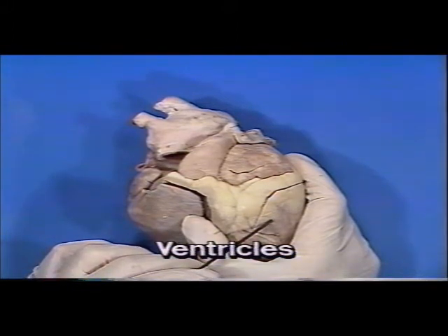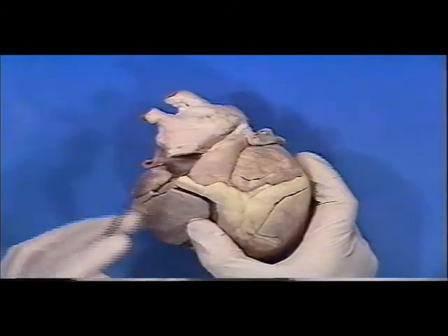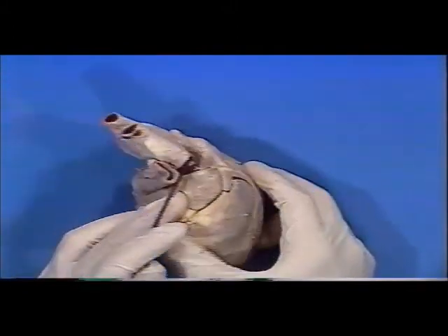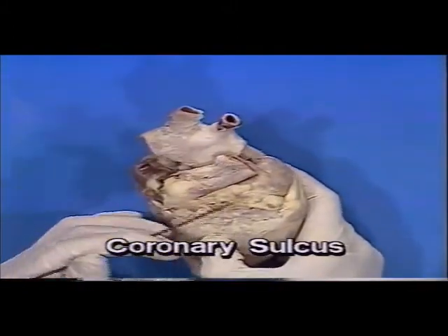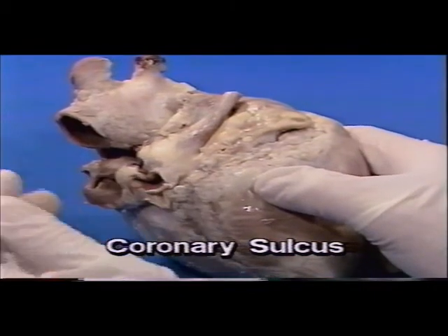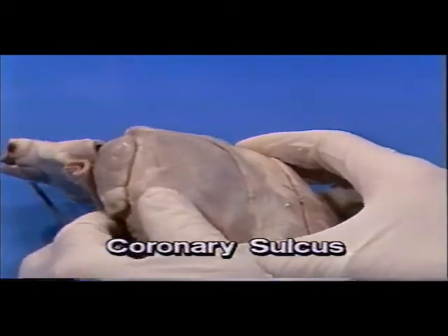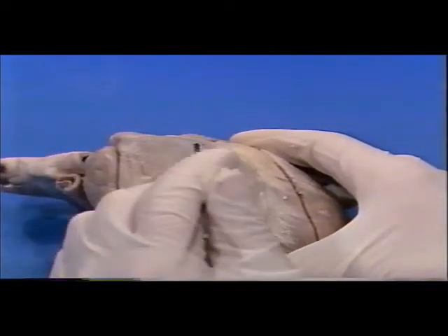Observe that the external border between the ventricles and the atria is formed by the coronary sinus and coronary sulcus or groove posteriorly, and the division between the 2 ventricles is marked by the course of the anterior branch of the left coronary artery.